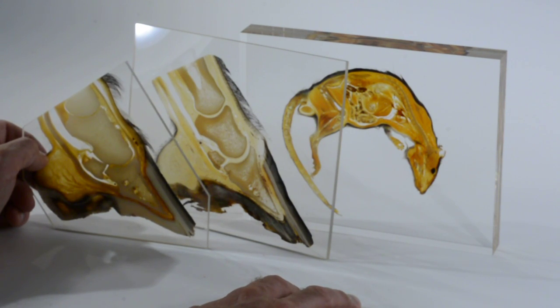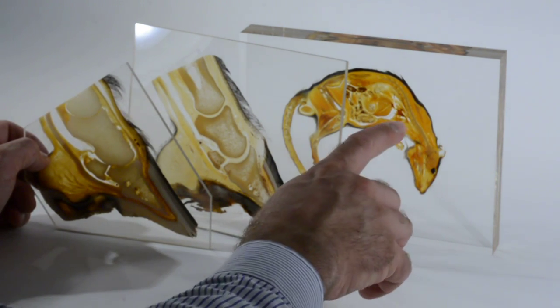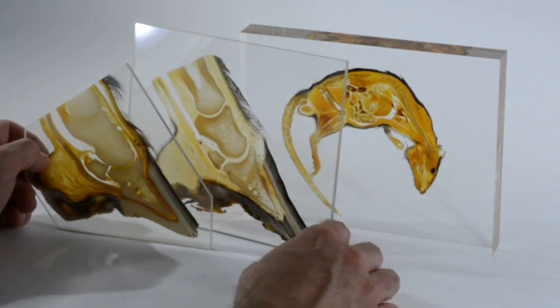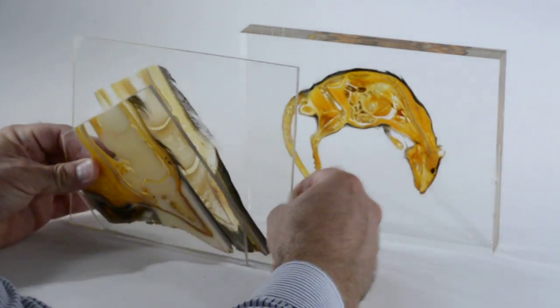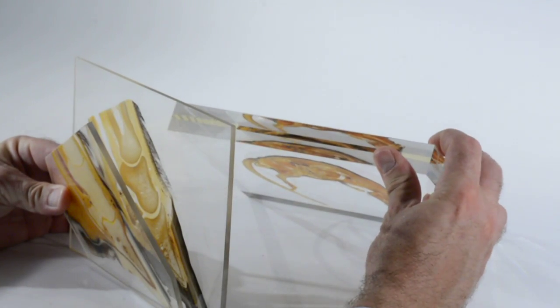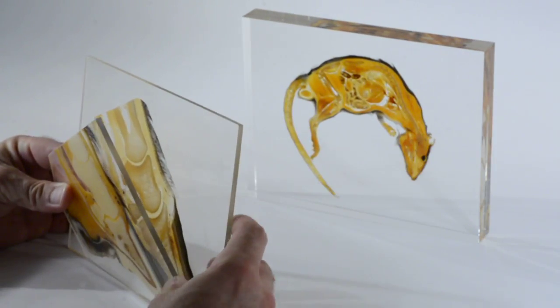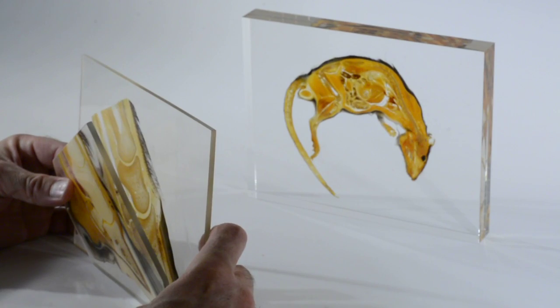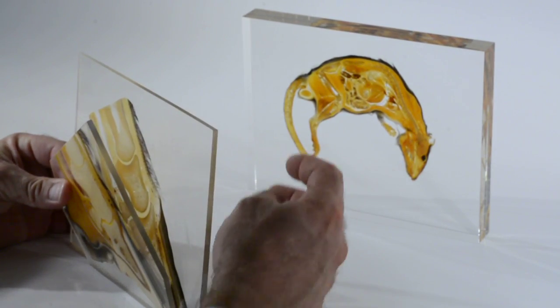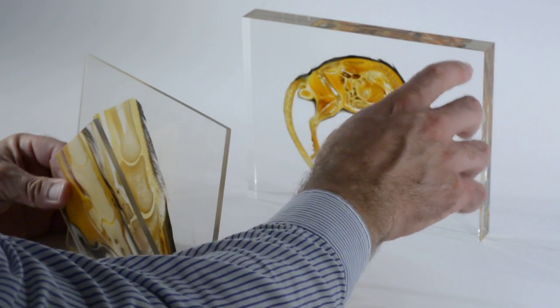The typical exhibition specimen is the so-called tissue-tracing sheet plastinate in acrylic embedding. What you see here, there's a specimen in the middle, there's acrylic on both sides. The specimen is protected from UV light, from scratches, from anything. Whatever happens is only happening to the acrylic.